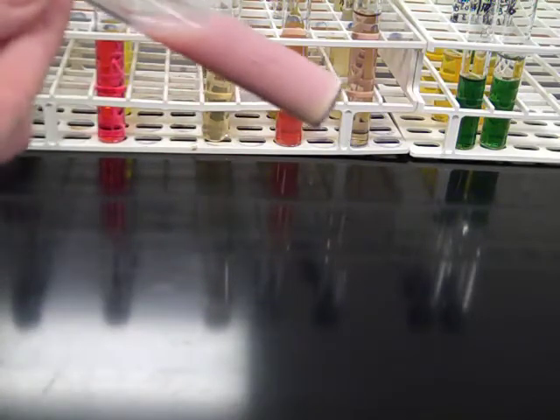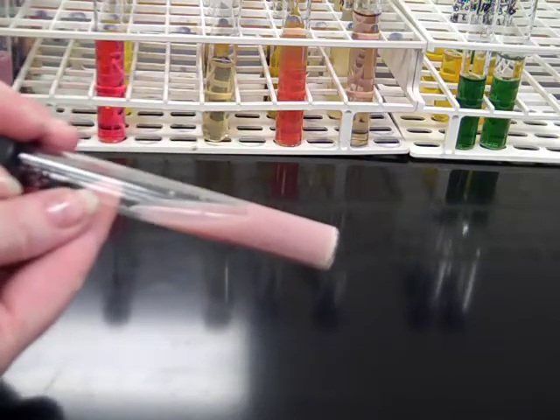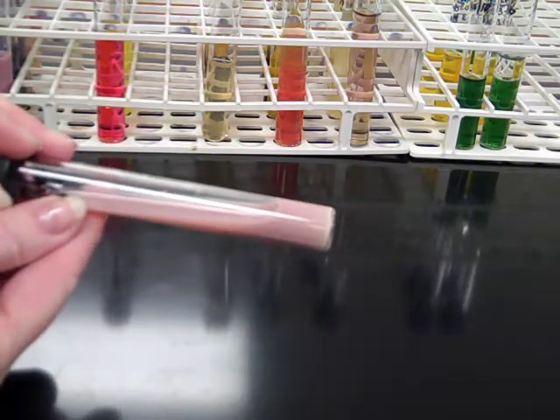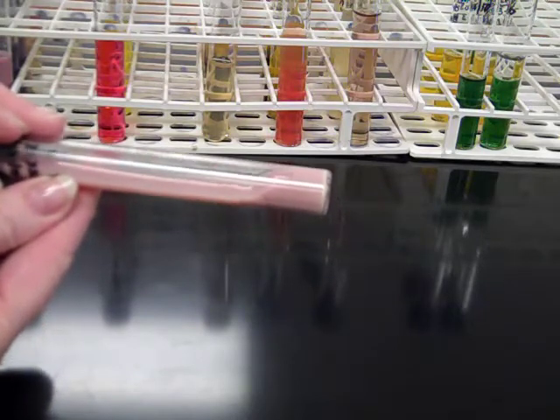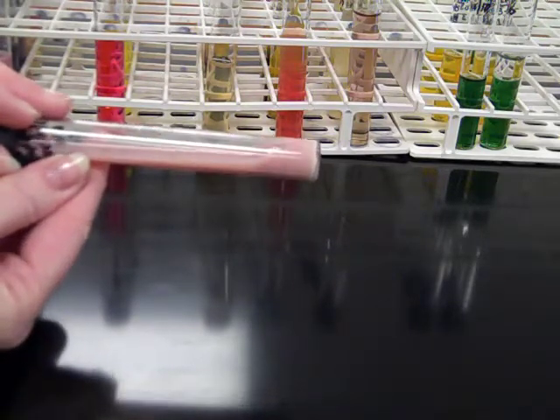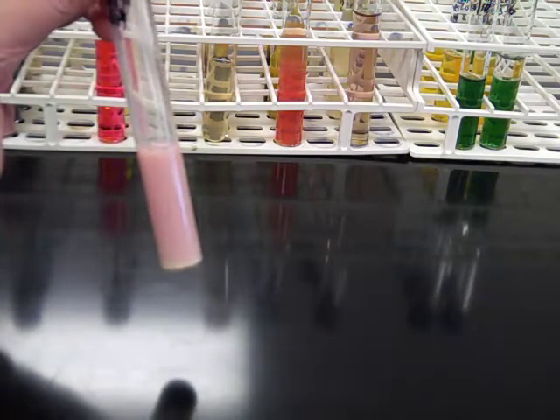However, when we tilt the tube, if we don't have a watery result, we look to see whether or not we have a curd — is the tube liquid or solid? In this case, we have a solid component, a soft curd in the bottom of the tube. A soft curd in the bottom of the tube is an indication that the organism was able to partially digest casein.